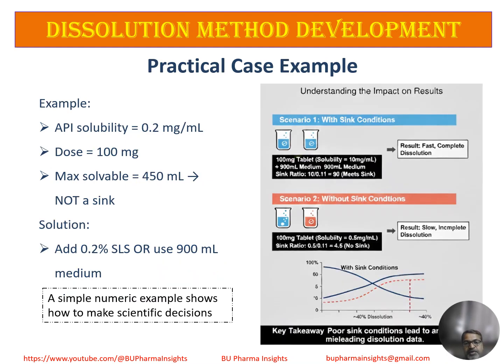Start by performing solubility studies in all potential media, then calculate whether sink conditions are met. Always document the justification clearly for regulatory submission.